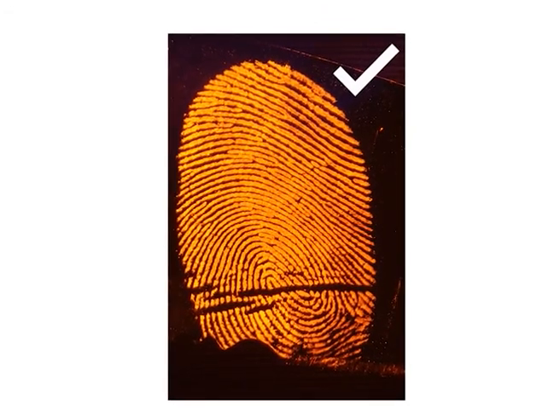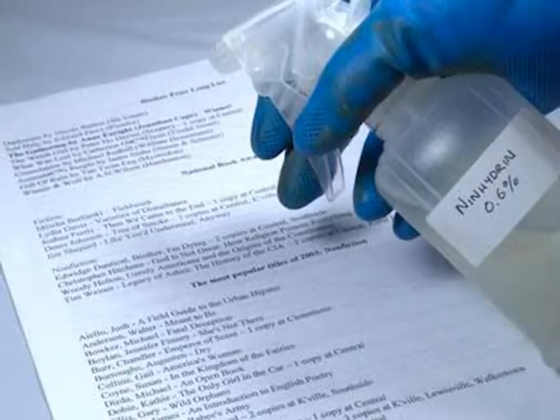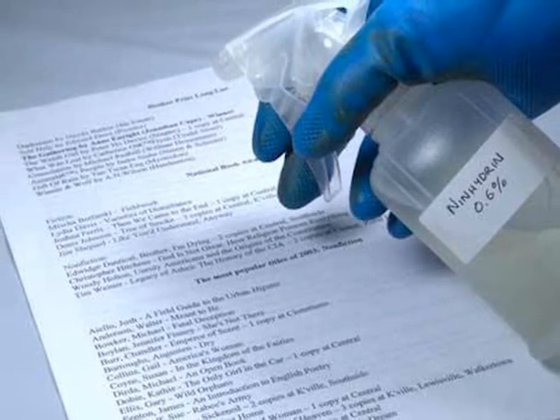On an average, DFO reagent develops 3 times more fingerprints than Ninhydrin. If DFO reagent fails to detect a latent impression, the Ninhydrin method can still be tried out on the same surface. However, if Ninhydrin reagent does not develop a particular imprint, the DFO method cannot be extended for its detection.